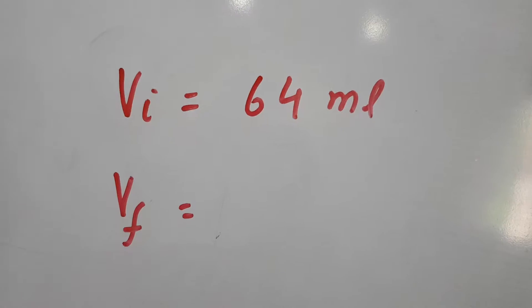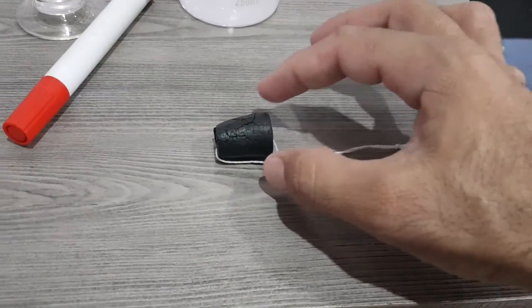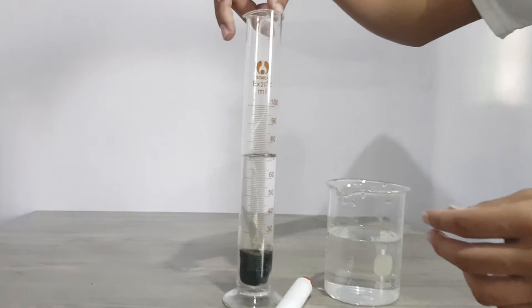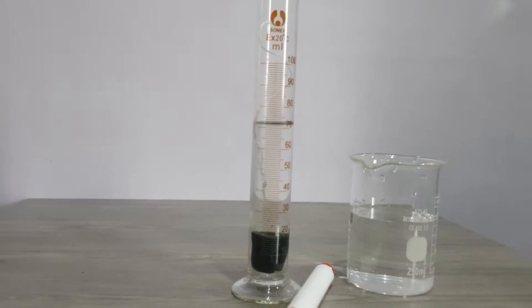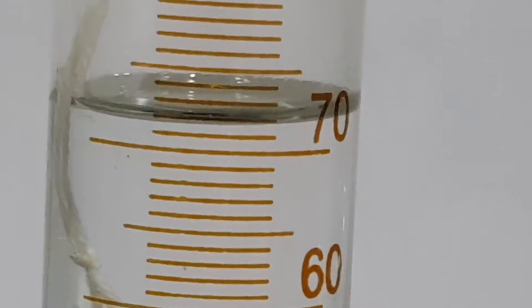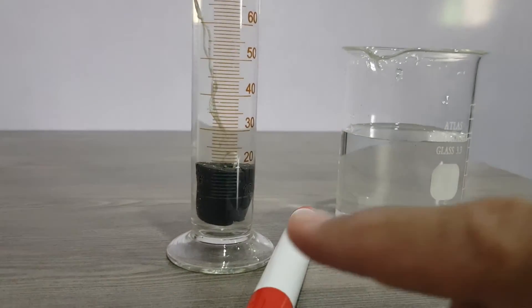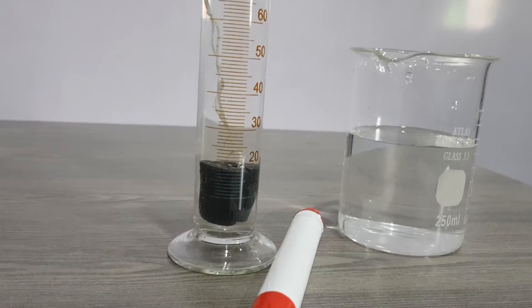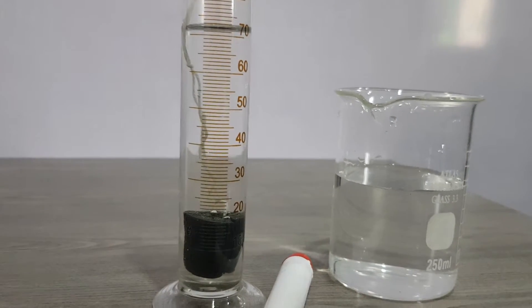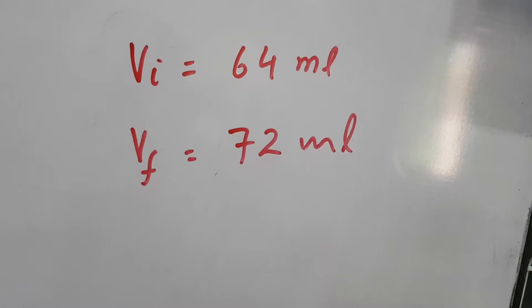Now we will find the volume of this cork. First, tie it with the help of a thread, then lower the cork into the water so it sinks. Note the volume — I think it is 72 ml. This is the final volume after putting the cork into the cylinder. The level of the water has risen because of the cork. This is the final volume: 72 ml.